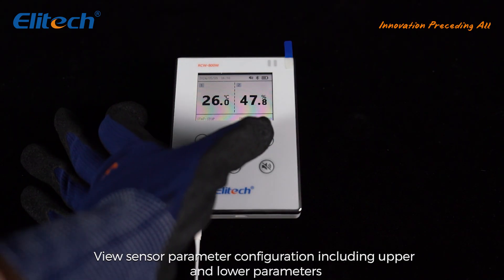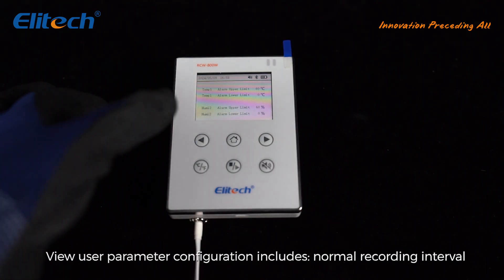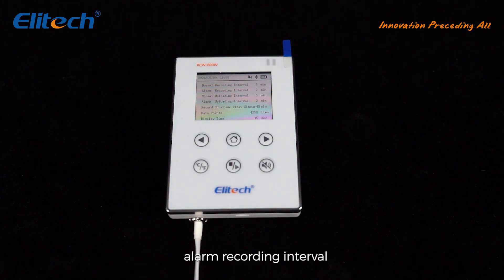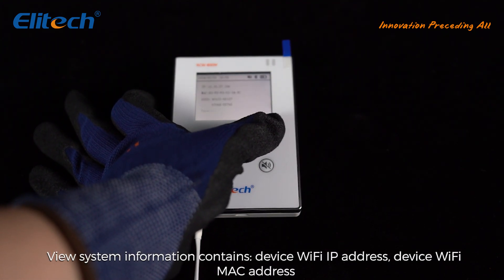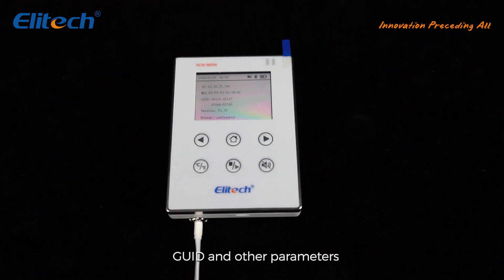View sensor parameter configuration, including upper and lower limit parameters. View user parameter configuration, which includes normal recording interval, alarm recording interval, normal upload interval, alarm upload interval, recording duration, and other parameters. View system information, which contains the device Wi-Fi IP address, device Wi-Fi MAC address, equipment ID, and other parameters.